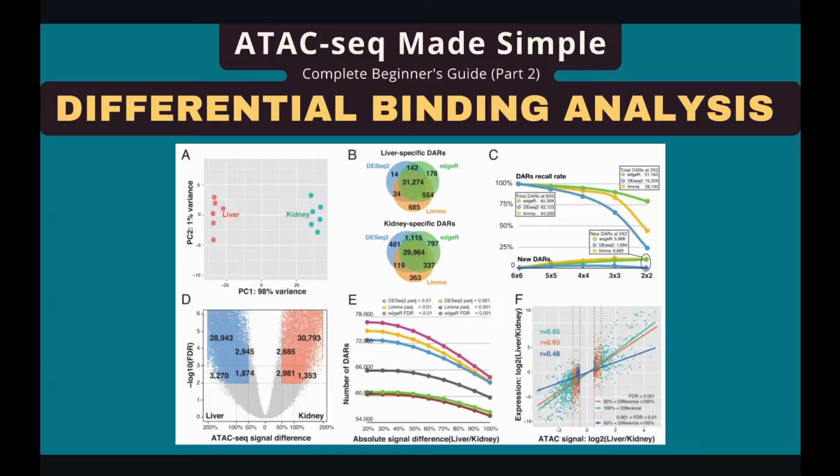So we have to create a consensus peak set, quantify this peak set across all the samples, and then perform differential analysis and all other downstream analysis. You can still use this method for ATAC-seq data analysis. However, this method involves multiple tools along the process.